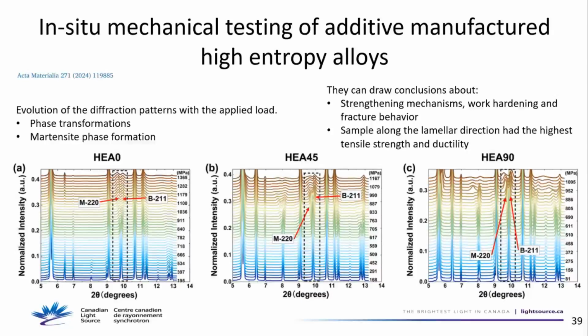They can draw conclusions about strengthening mechanisms, work hardening, fracture behavior, and they can see how the anisotropy in the sample influences these mechanical properties of the materials. I'm approaching the half-an-hour mark.